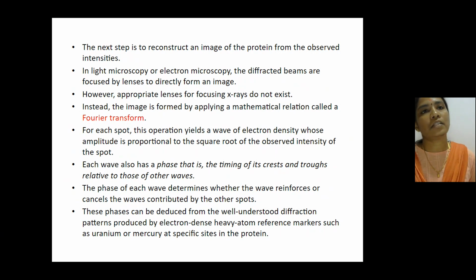You can compute the amplitude, but you cannot know the phase of the X-rays. That's why it is called the phase problem. The phase is very difficult to determine. It can be solved by many methods, which I will explain in the next slide.